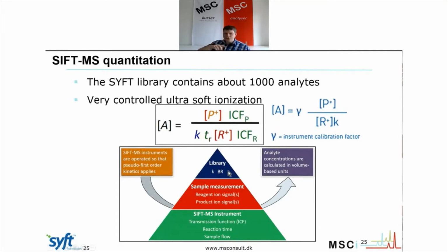So when you have dissociative electron transfer, it splits the same way every time. So you can say that you get 20% of the lower ion and 80% of the higher ion. And you can put this into your library and you can add your own compounds. To add your own compounds, you just need to know the concentration of the standard you're running.